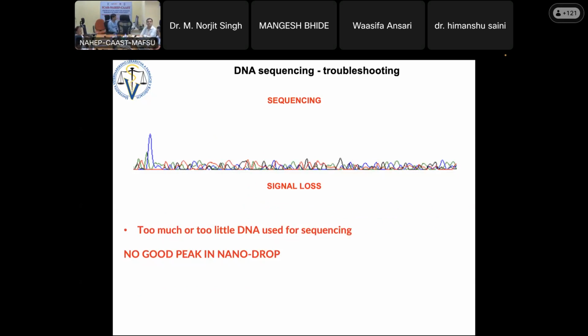Okay, so for example, you have a high peak. The first 2 or 3 nucleotides are very intense, and then you lose the signal. That means the company has put a lot of DNA or very little DNA in the cycle sequencing. It is not your problem, it is the company's problem.